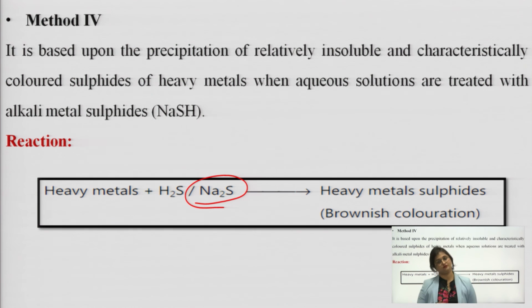The brown coloration formed in the test is compared with that of the standard. As I've already mentioned, we take a known quantity of standard, whereas in our test we have an unknown quantity. So this being a semi-quantitative test, we can simply say whether our sample passes the limit test or fails.